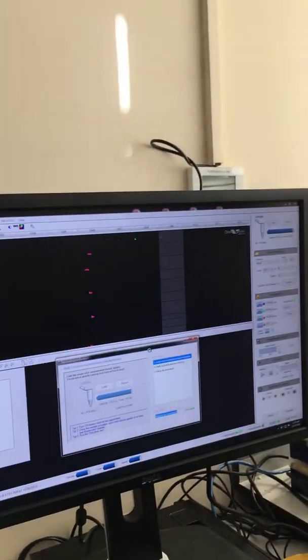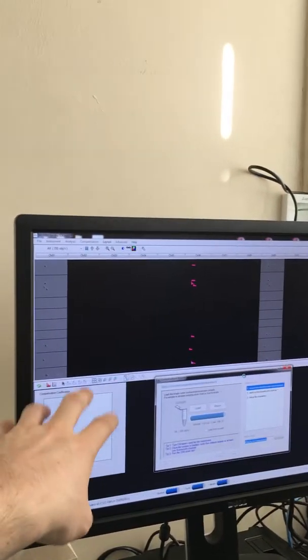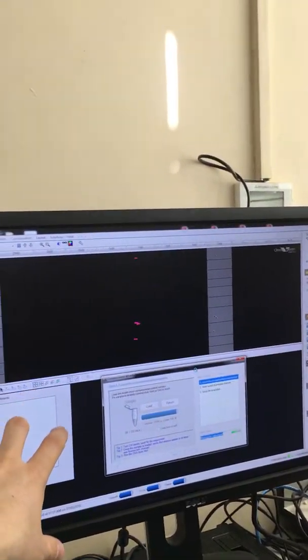Here you've got this new window, compensation coefficients, that wasn't there before. Your side scatter plot is being hidden right now, and there's something else overlaid. So this is all fresh. If you just press next now, it's not great.